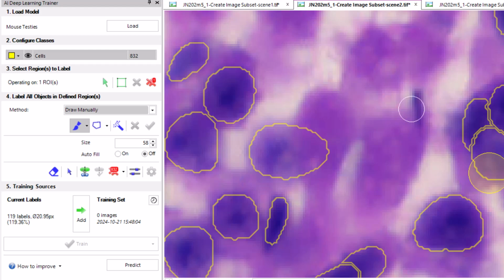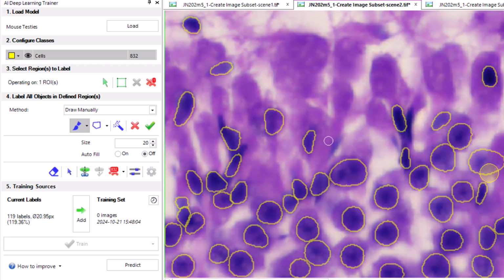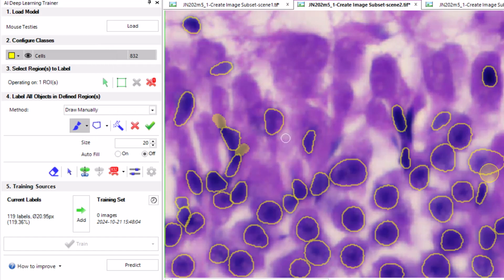As I zoom up, I can either zoom up the image or I can hold down the control key and dial in that brush, whatever is appropriate. So I can just draw that in, and now I can actually draw a couple of these in where I'm missing some. So there's one. And you'll notice I went over the boundaries. That's okay. There's a feature here called Merge and Edit in this drop-down, which would allow me to merge these together. At this point, I want these to be separate objects, so I'm not going to do that.